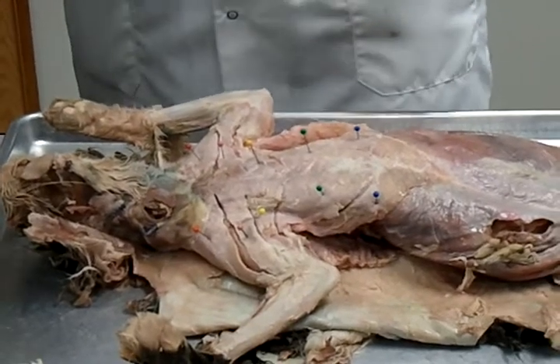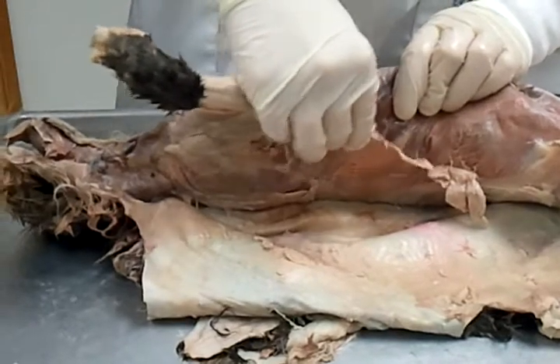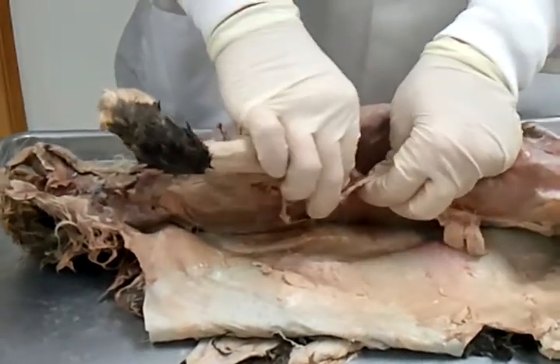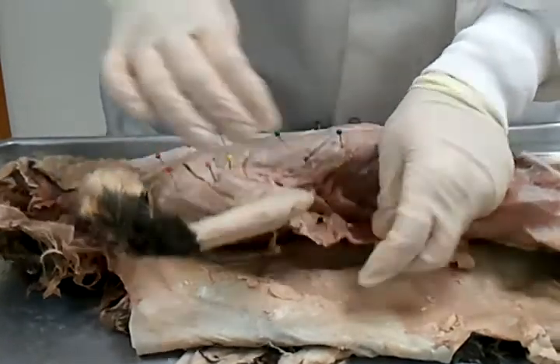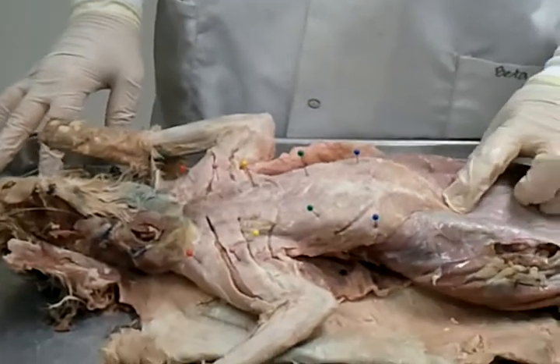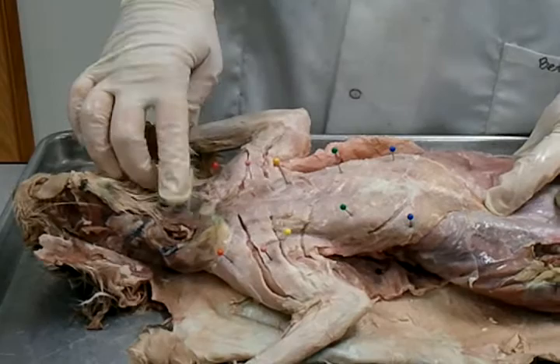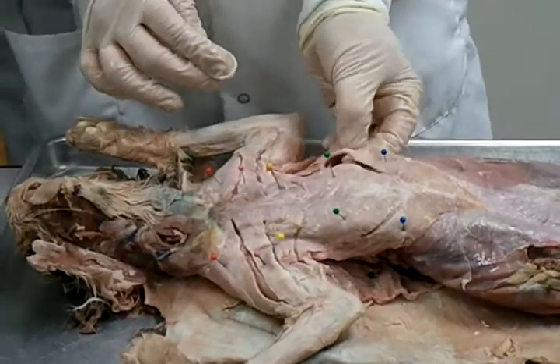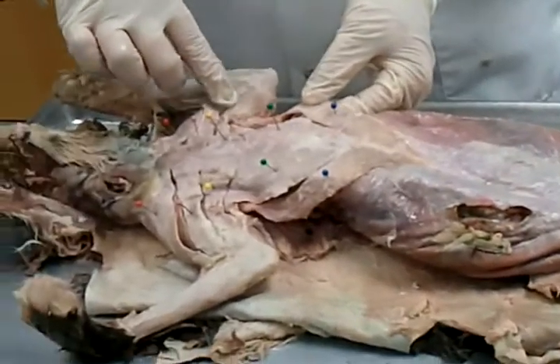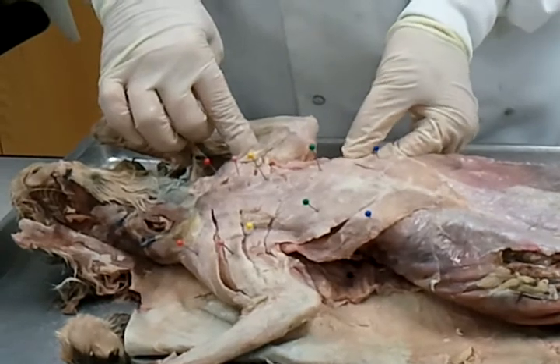There is one on each side. I didn't separate it out over on this side as much, but here it is, right here. Okay, latissimus dorsi. All right. The rest of them are in the chest region. So we're going to walk from the tip of the sternum, the xiphoid process, all the way up to the neck. Okay. So from the xiphoid process to the shoulder, there's this one called the xiphi, and it's going to the arm, humeralis. Xiphoid process to humerus, Xiphihumeralis.